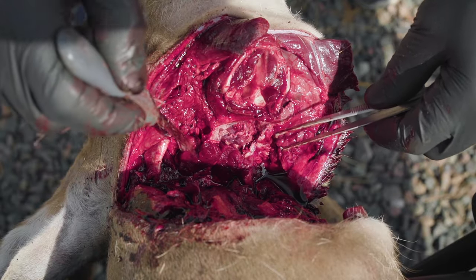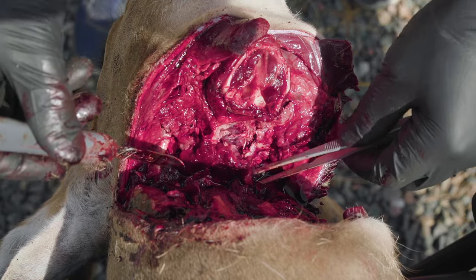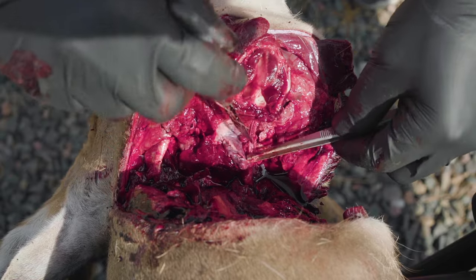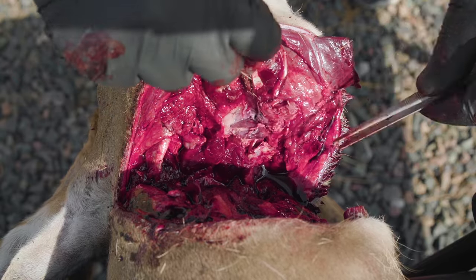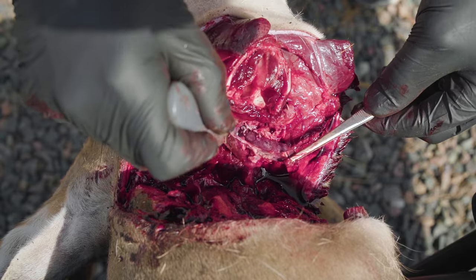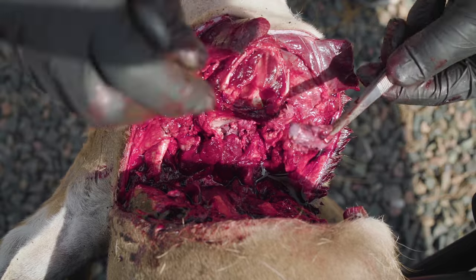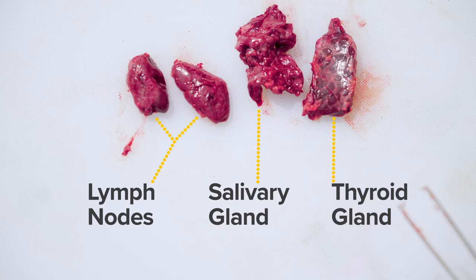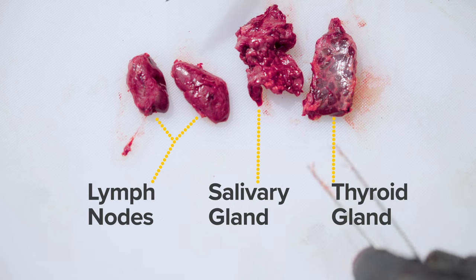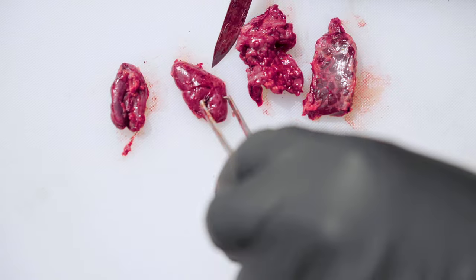You can see I'm peeling back that salivary gland, digging in. Again, you'll find those lymph nodes at about 10 o'clock and 2 o'clock. You can see that one here — it sits right here on top. I'll slowly dissect that out with my scalpel. You can use your hunting knife, of course, that's just fine. But you can see these lymph nodes look much different than the surrounding tissue — much different than salivary gland. We have our lymph nodes here that we just extracted. Kind of a bean-shaped organ. Pretty easy. This one's been cut so you can see the inside of it.